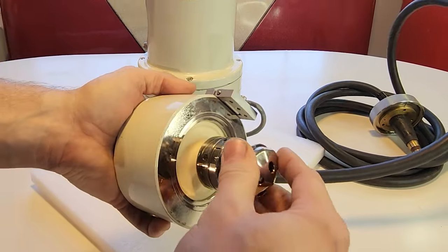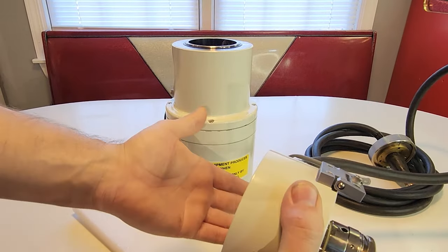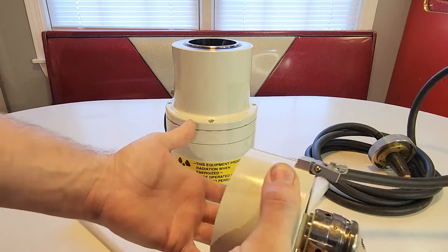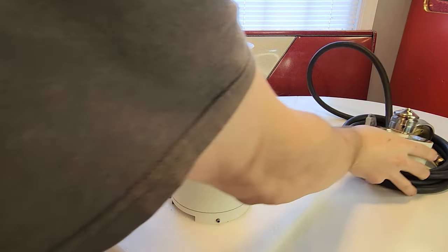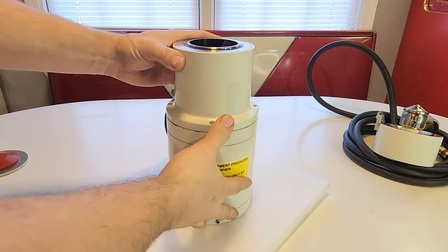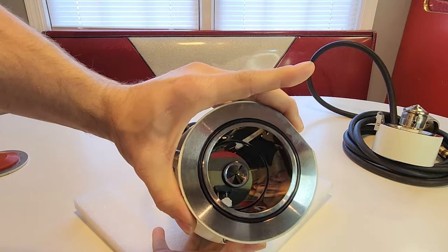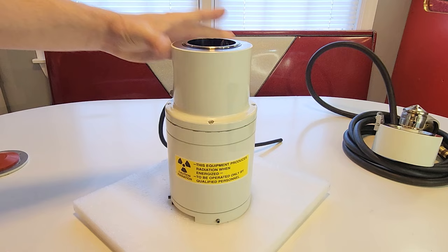We go ahead and stick that back into place. This piece is about 12 pounds — ridiculously heavy. Now we're left with the main column. It doesn't look like much, but if I tip it forward you can look down inside — that's where the electrons go. You can see how polished the interior is. It's absolutely gorgeous.